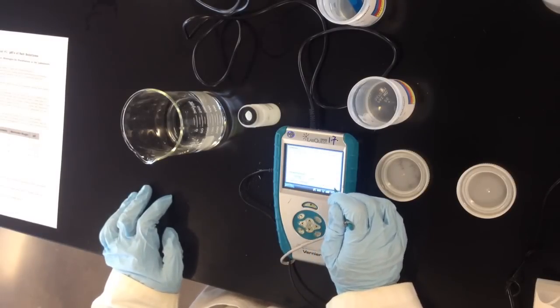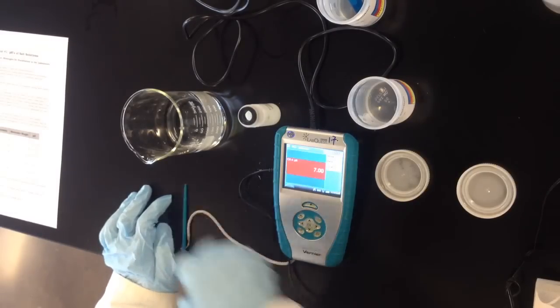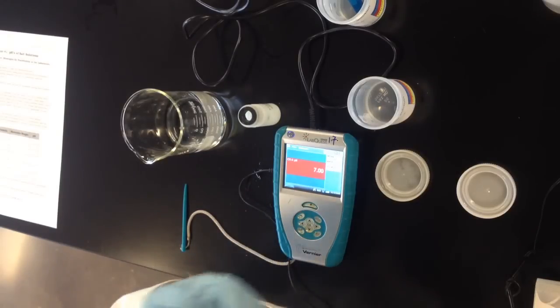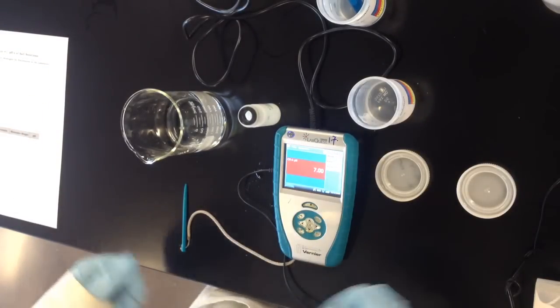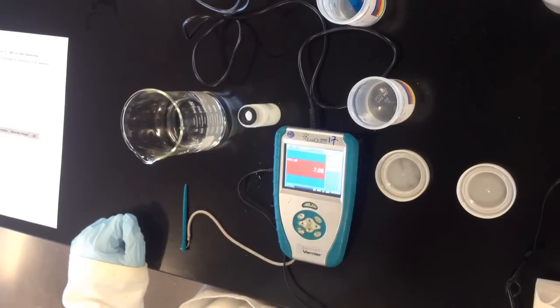Once I hit keep here, I can hit OK and the LabQuest will internally build a calibration curve from these two points and assume that they're connected through a line to build the calibration curve. And notice that now the pH reading is stabilized at 7.